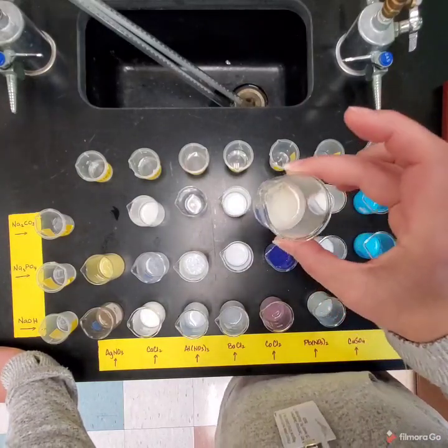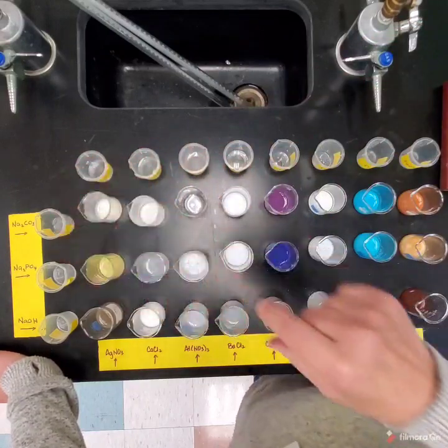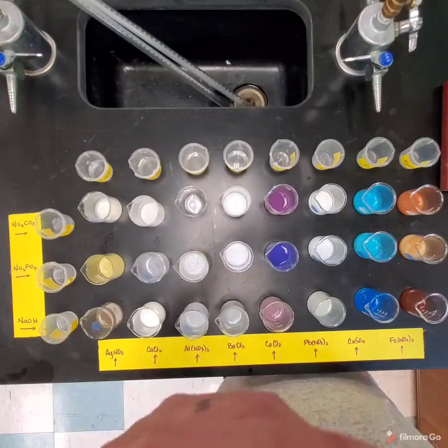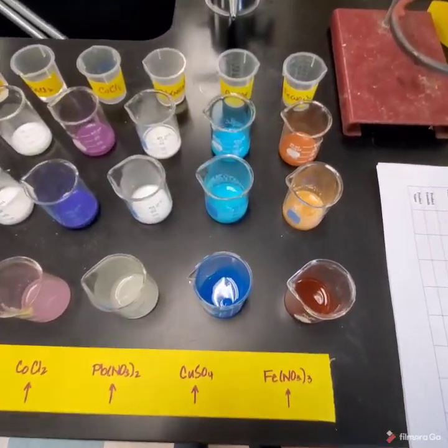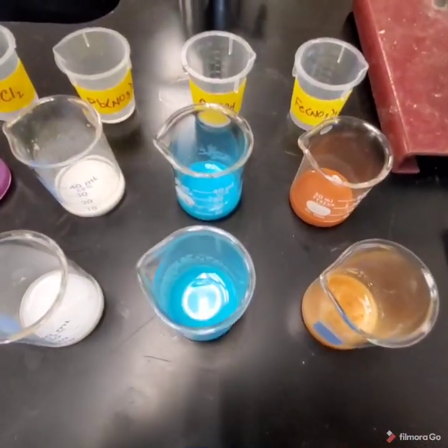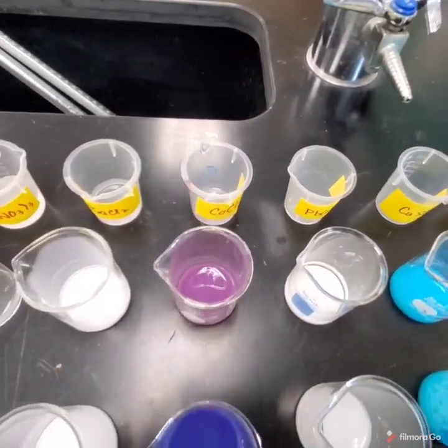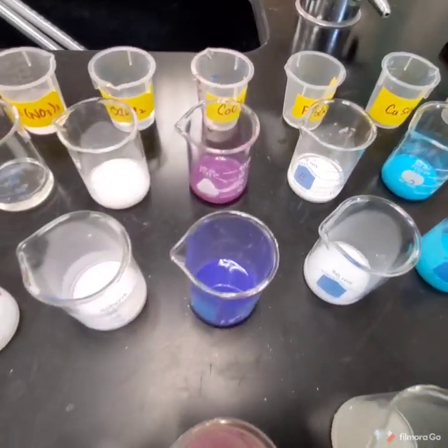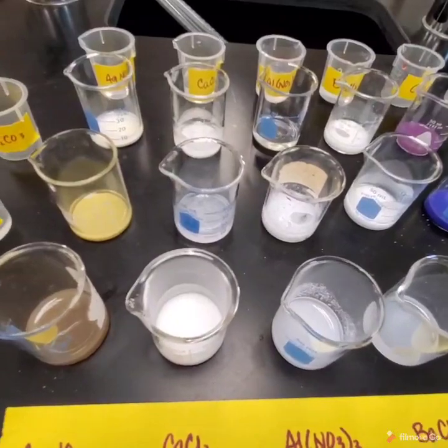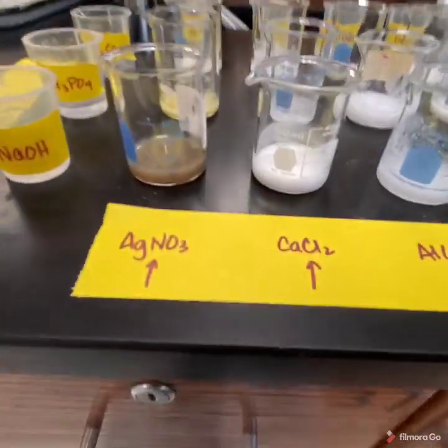Now I do want to show you, it might be kind of hard to see, but this is the first one we did. If you let it sit, you see a water layer form on top, and you'll see the solid settle out. Here is a close-up of all of them, and I will look at the side so you can see that some of these have settled out and the liquid layer forming on top.